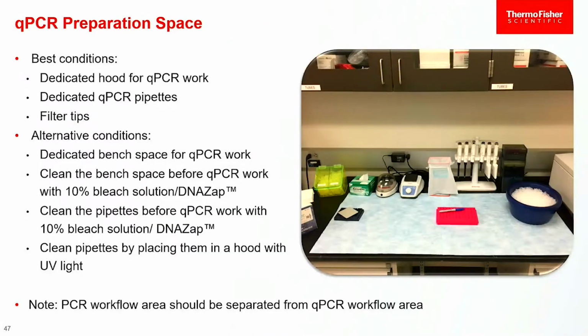So if you've never worked with these amplification reactions before, you're going to need to know that DNA is going to float around. It is like magical. It will float. Sometimes just opening a tube and then swinging it over your negative controls is enough to get amplification in your negative controls. Seriously, it's like magic.